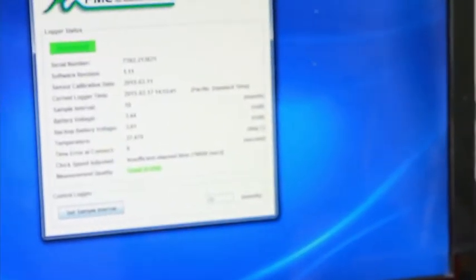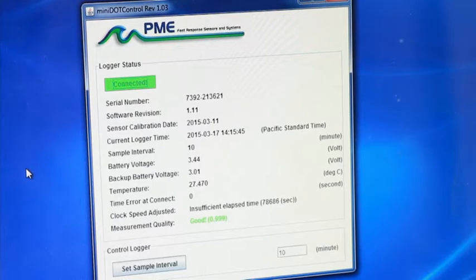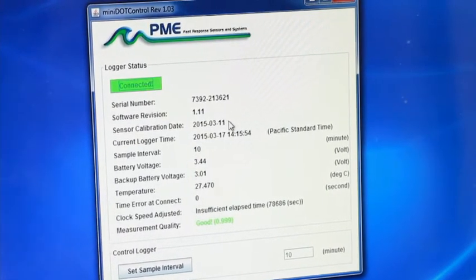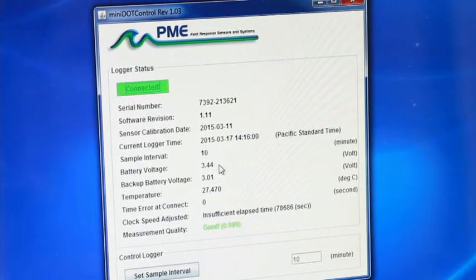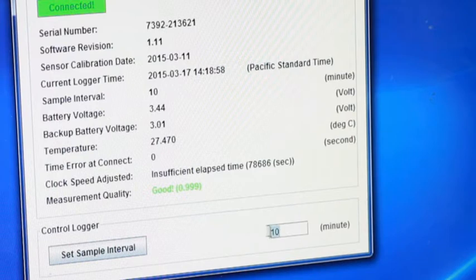Now you will see the various information about this logger: the serial number, the software version, when the sensor was last calibrated, the current sample interval, battery voltage, and time error since the last time this logger was set. The sample interval can be changed here. We will set it to record every minute.